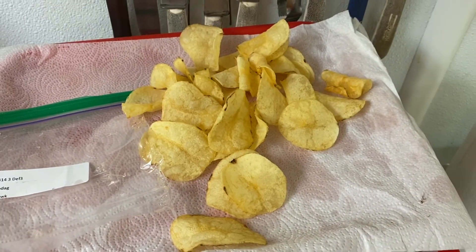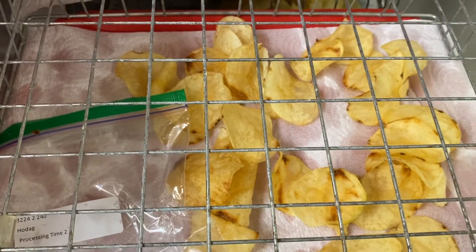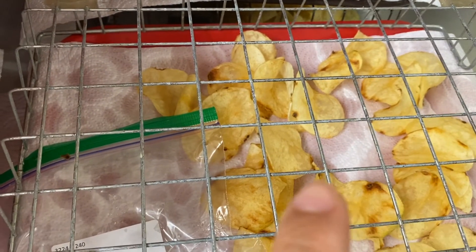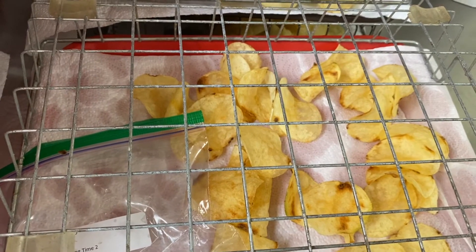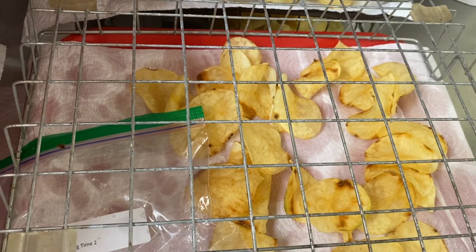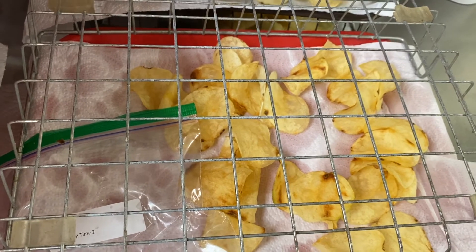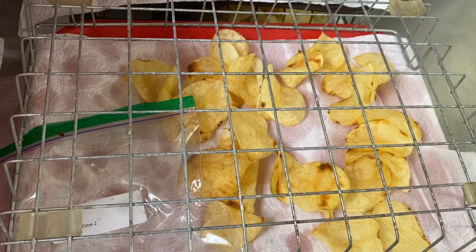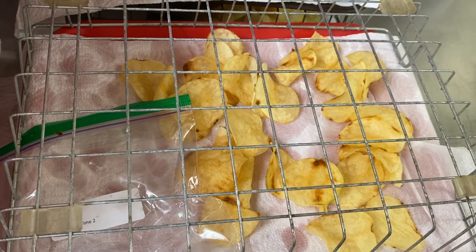This one looks good. And interestingly, this one shows some dark spots on one end of the chip. This problem is called the stem-end chip defect, usually associated with heat stress during the late growing season. So this is not a good sign for making good quality chips, and researchers are studying how to avoid this problem.